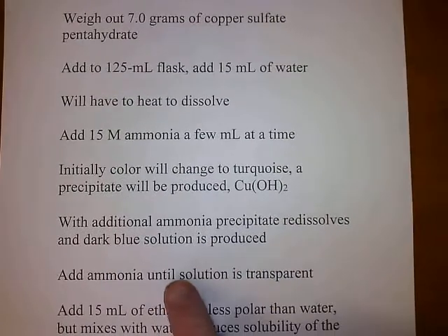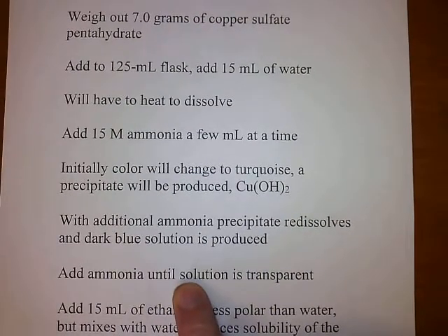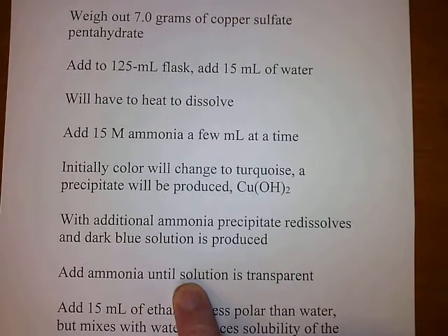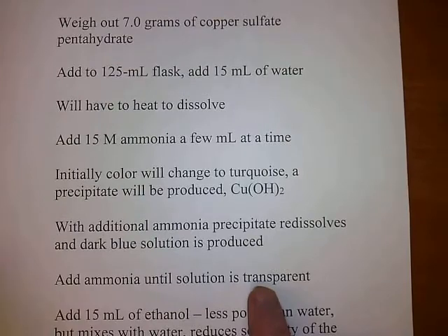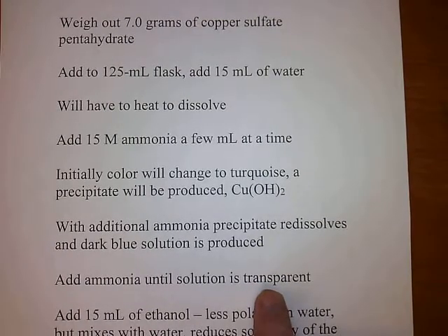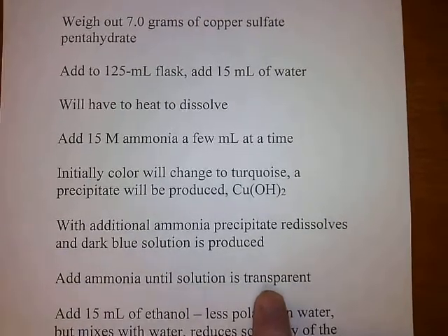So you're going to add ammonia until the solution is transparent. Remember, there's a difference between colorless and transparent. All transparent means is that you can see through it.